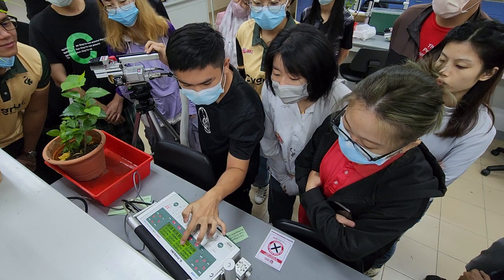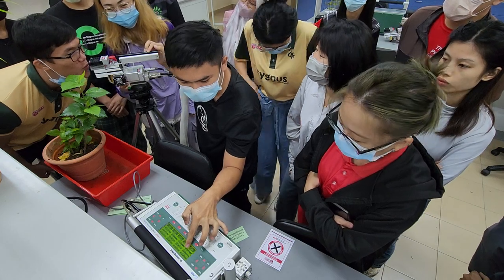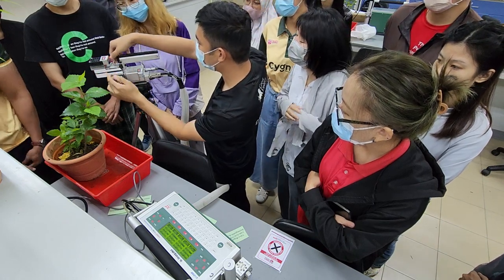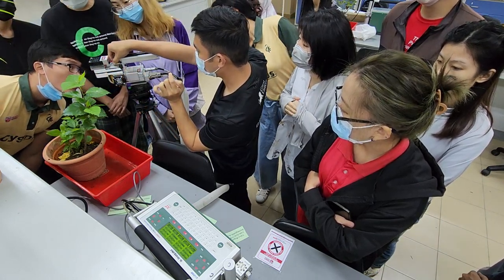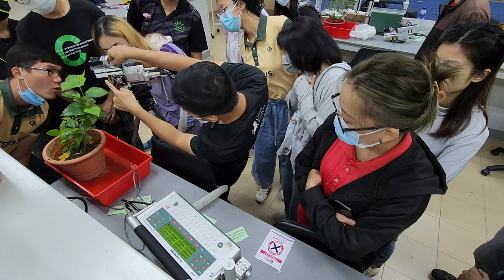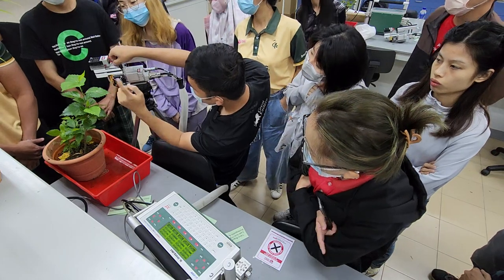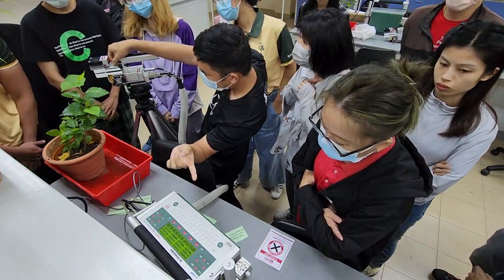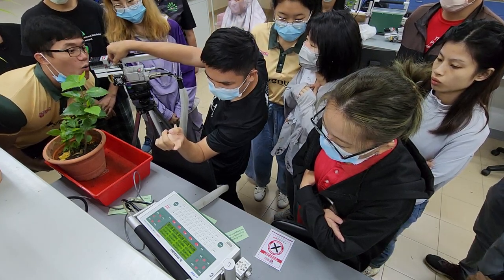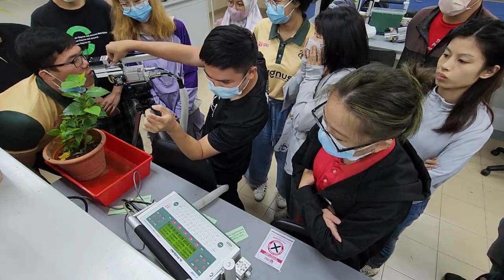Is the R increasing? A bit. So that means there is a leakage here. So you need to tighten this up. How do you tighten it up? Just turn. Yep. This one is loosened up. If you turn to the left, it loosens. You see it is opening, right? So you need to tighten this until there is no leakage here. So you can blow. Still increasing, right? So you need to tighten it up.